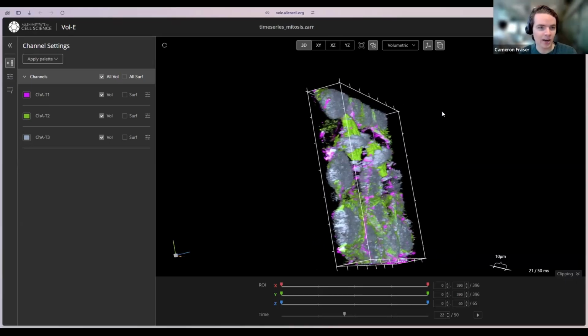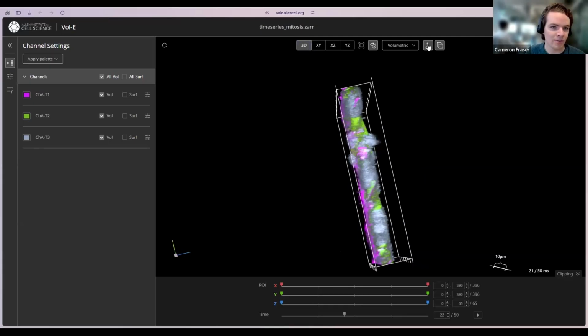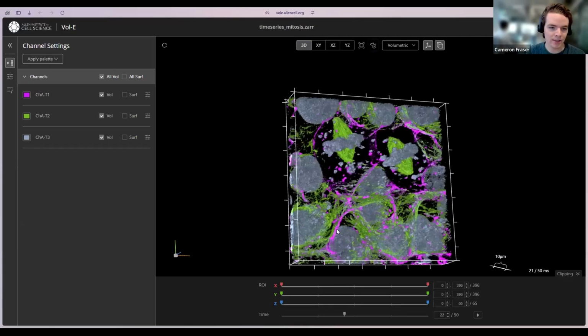As well, we are working on better integration with BFF. Obviously, BFF can already pop out an individual volume or an individual image out of a row of that spreadsheet view.